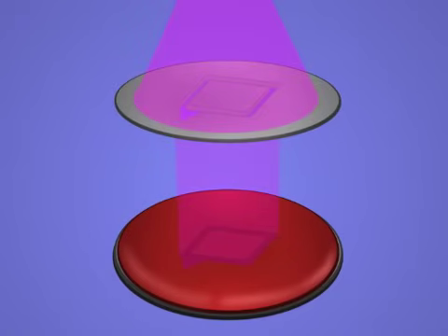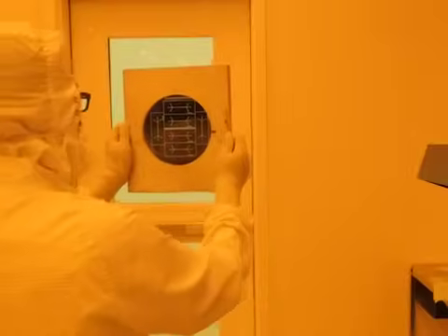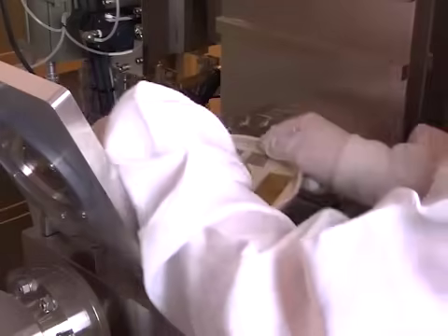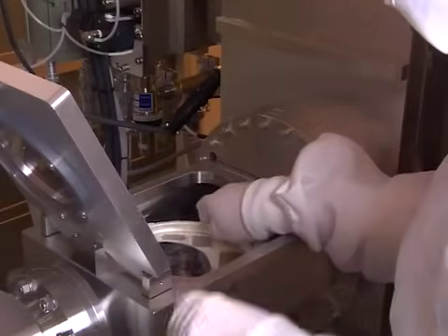This video will introduce the process of photolithography, demonstrate the technique in the laboratory, and provide insight into some applications where photolithography is used.